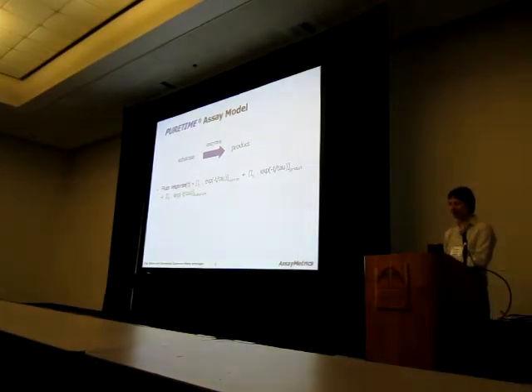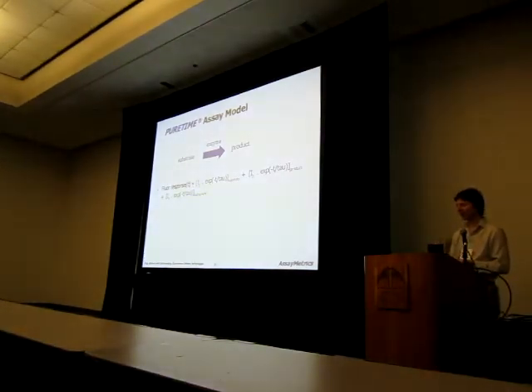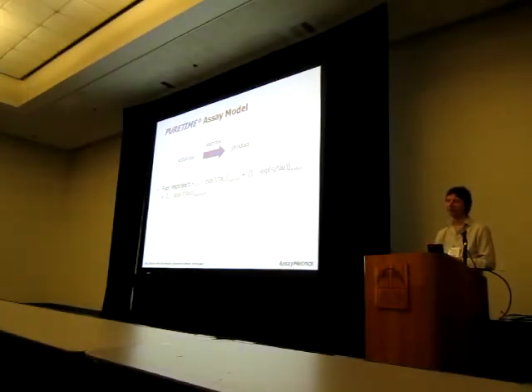Together in the assay well, you also have the fluorescence contribution of the product, again decaying away with a time constant, minus t over tau. And simultaneously, you detect the contribution due to background. And because you detect and measure the contribution due to the background, you have the opportunity to make corrections for background contributions in assays.